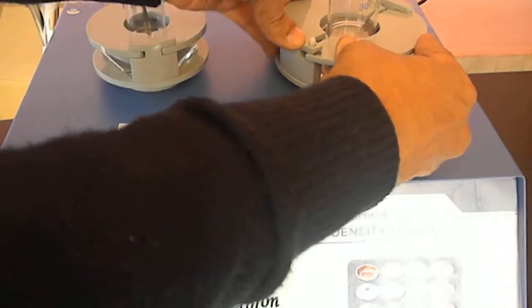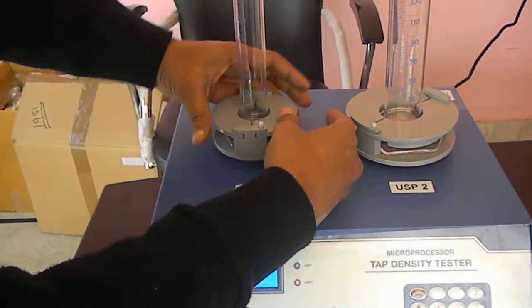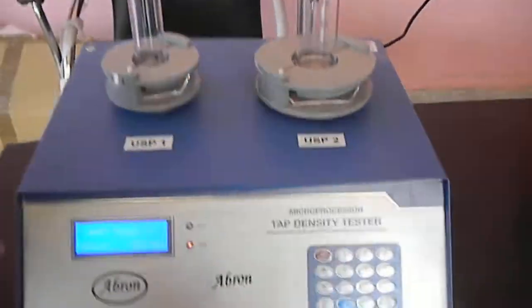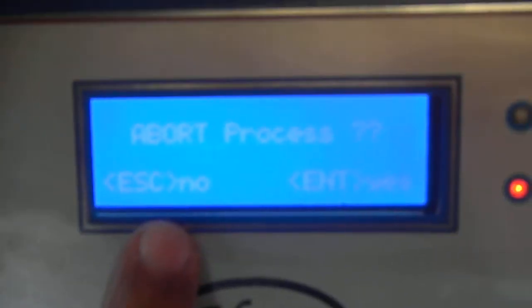See that this is closely and completely locked. Again this is locked — you cannot open it. Now the process is, there is one escape point. You can press escape.